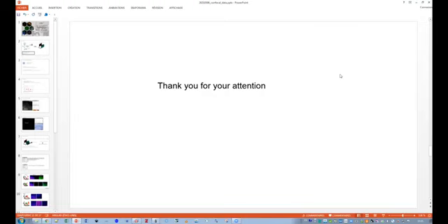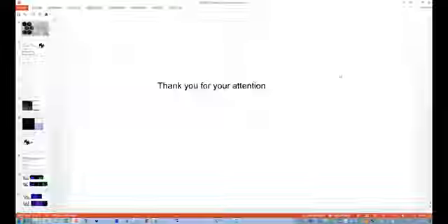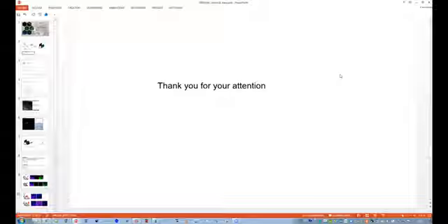If you know that you will have only one fluorescent signal, you can do what we saw together. You just have to extract your fluorescence spectrum from your images. I would say that you apply a binary mask and then you create your fluorescence spectrum. But if I do see that there is an additional component in that signal, then I have to go to the eigenvectors and do the process. Okay.